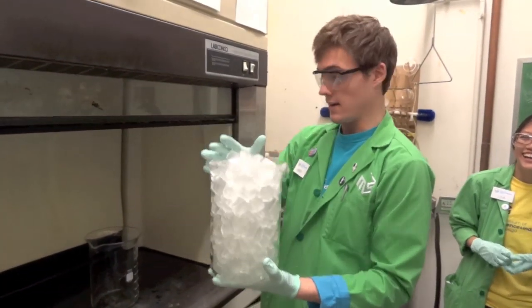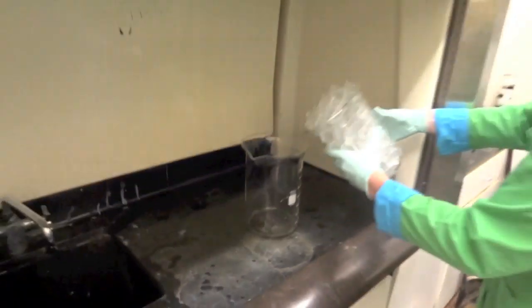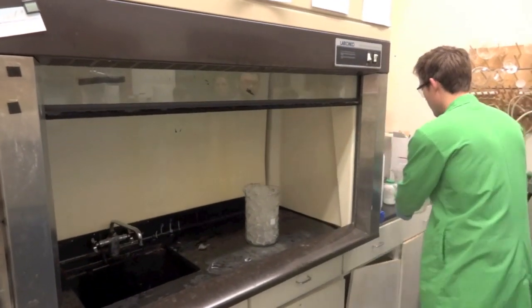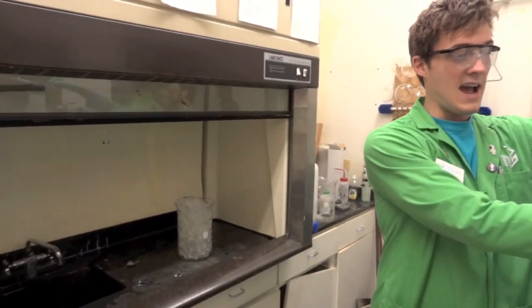What we're going to do is take this beaker of ice, and in this beaker we have a little layer of something called calcium carbide. So when we pour the ice on top of the calcium carbide, the calcium carbide is going to react with the water and start releasing acetylene gas.